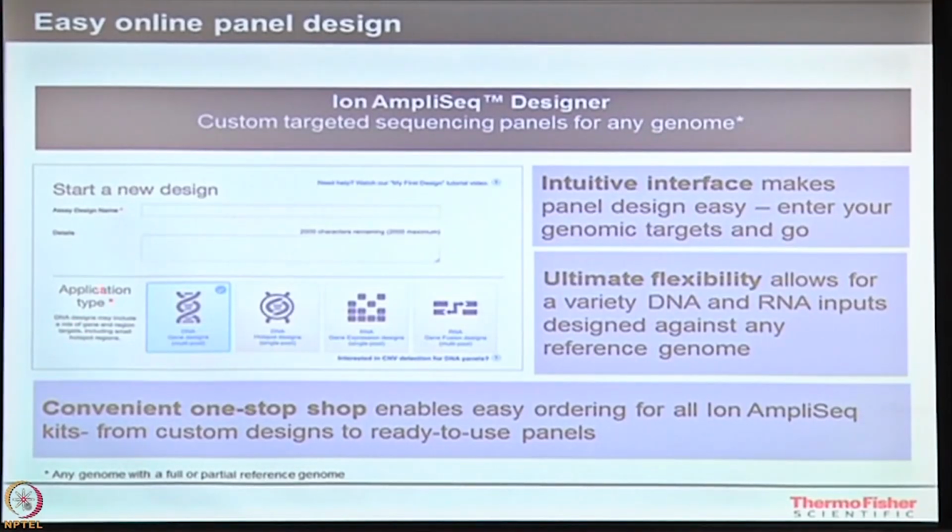So you can see the first option is DNA over here. This is like a gene-based design that you can do where you can provide just the HUGO nomenclature genes over here. You must be knowing about EGFR if you have any idea. You know about some BRCA genes, BRCA1, BRCA2. These are some of the genes which are studied a lot in the entire world. They are studied for their different variants and for different purposes, where they also want to get to know which drugs are acting in regards to cancer and your hereditary disease.